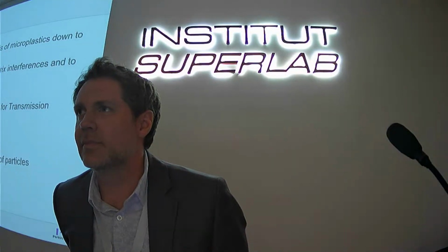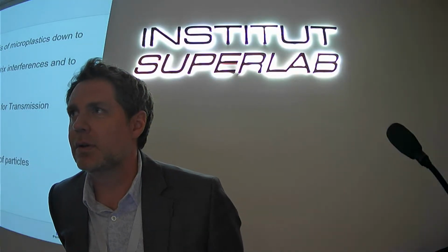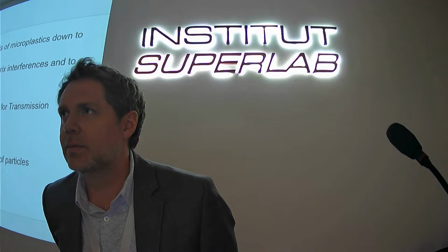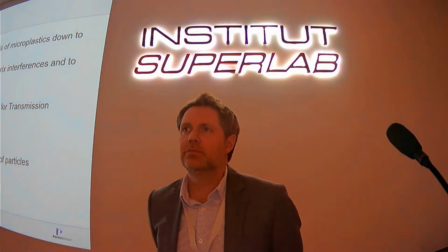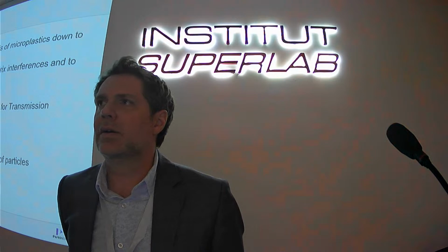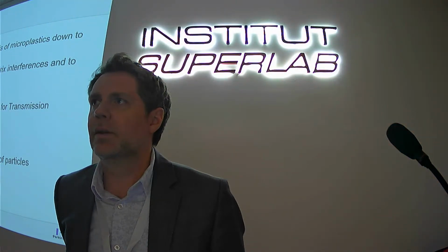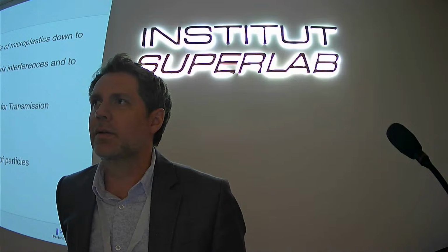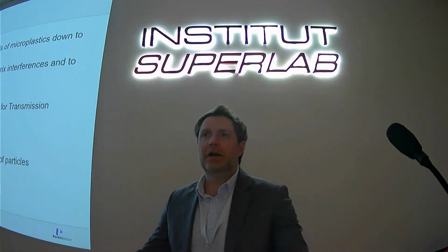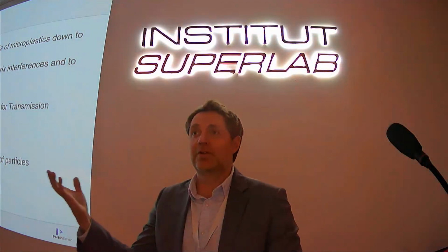Thank you for the nice presentation. I'm interested more in the principle of Z stacking that you mentioned on the new microscope. How does it work when you have a material which is thick, and in what mode does it do the Z stacking? As you say, for a thick sample, it has to be reflectance.